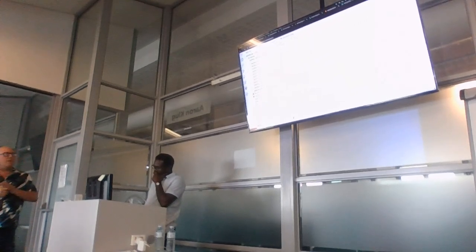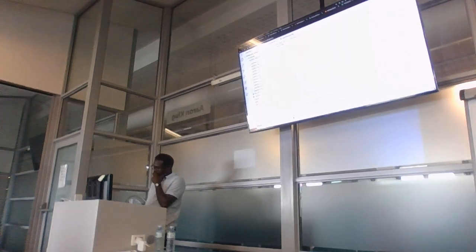It's not going to be easy to fix, but what we can do is I will fix the data on our side. I will gzip it for real, and then your script will probably start working. I think your script is right. It's just that the data is wrong, but we will fix it up so that people can do it in their own time.